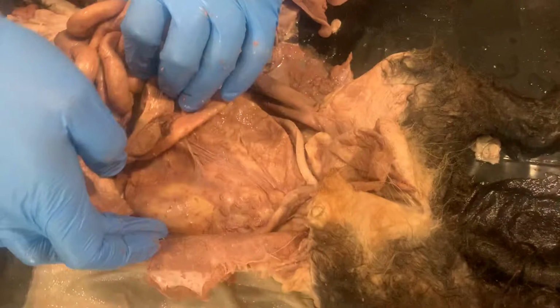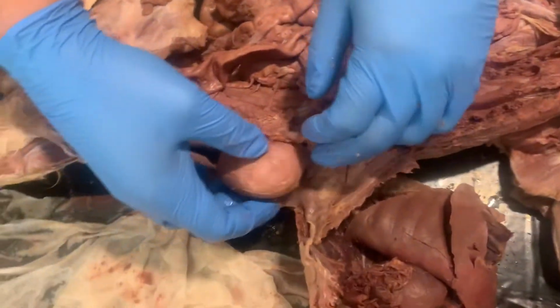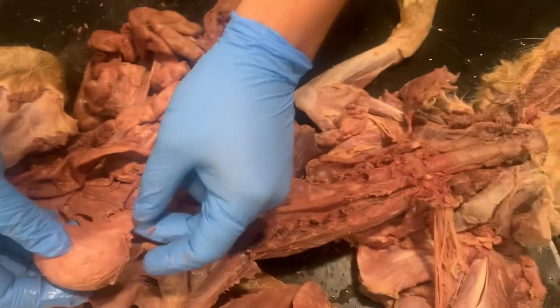Now, I didn't dissect out the kidneys on this side, so let's look at this cat for kidneys. This is a kidney. So we have a kidney on either side.